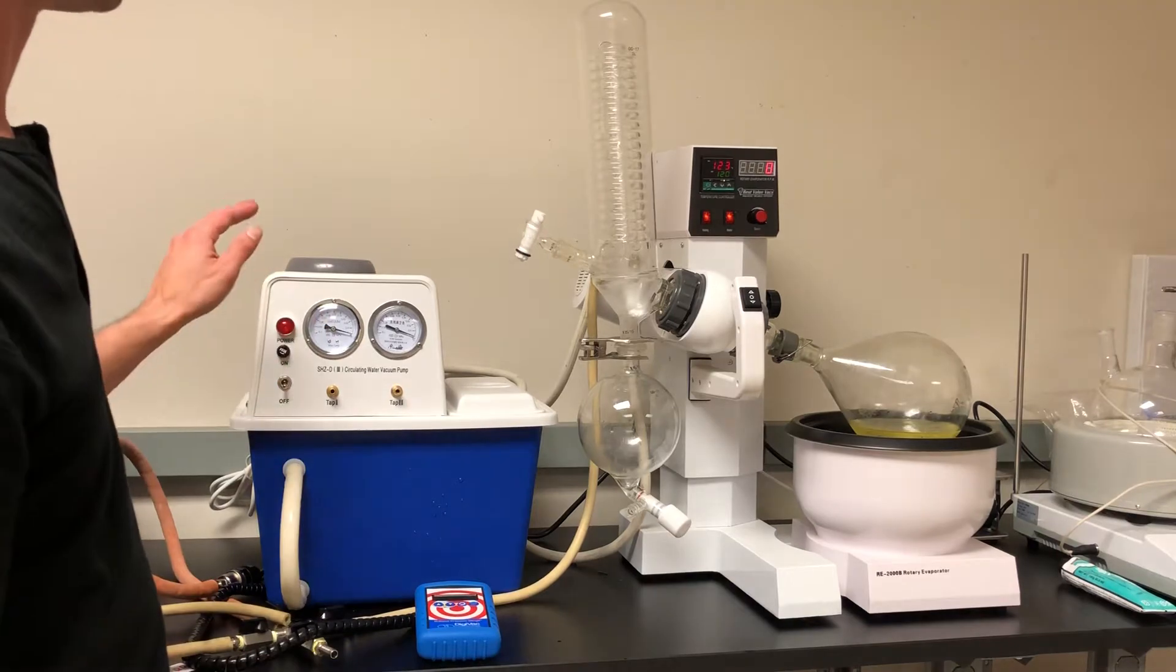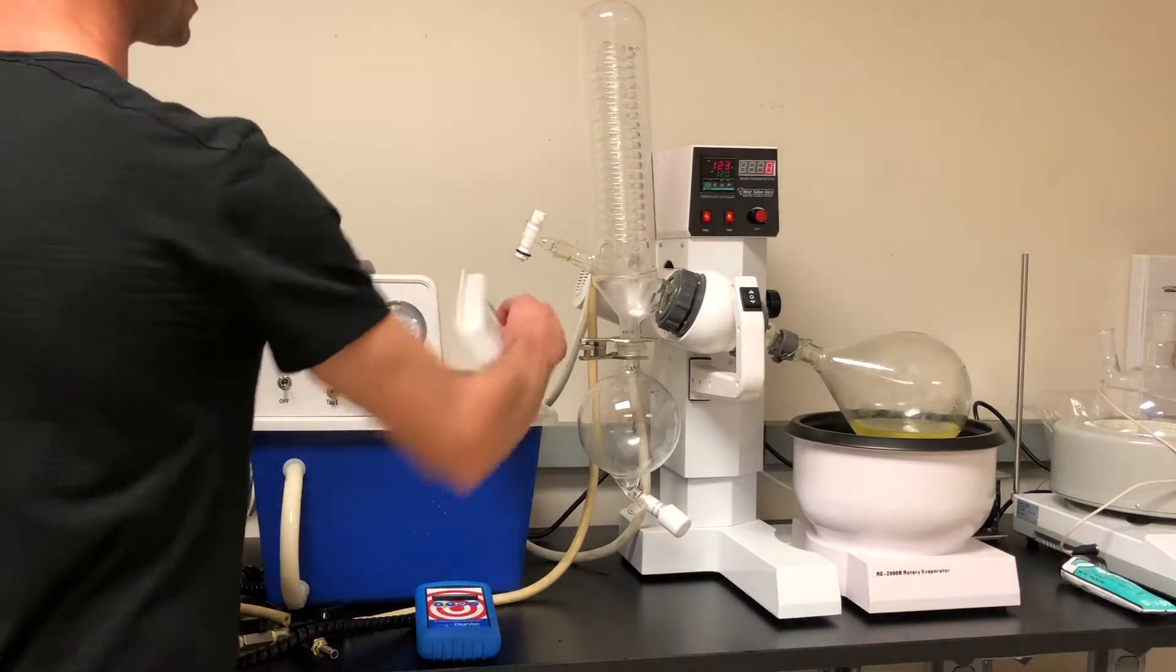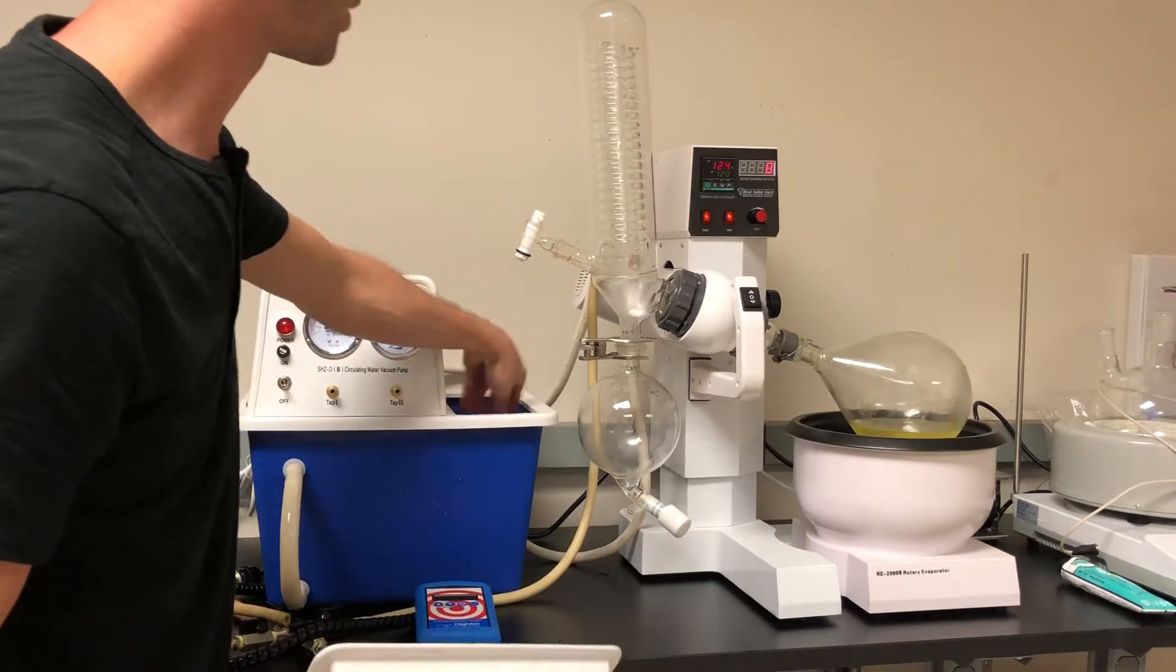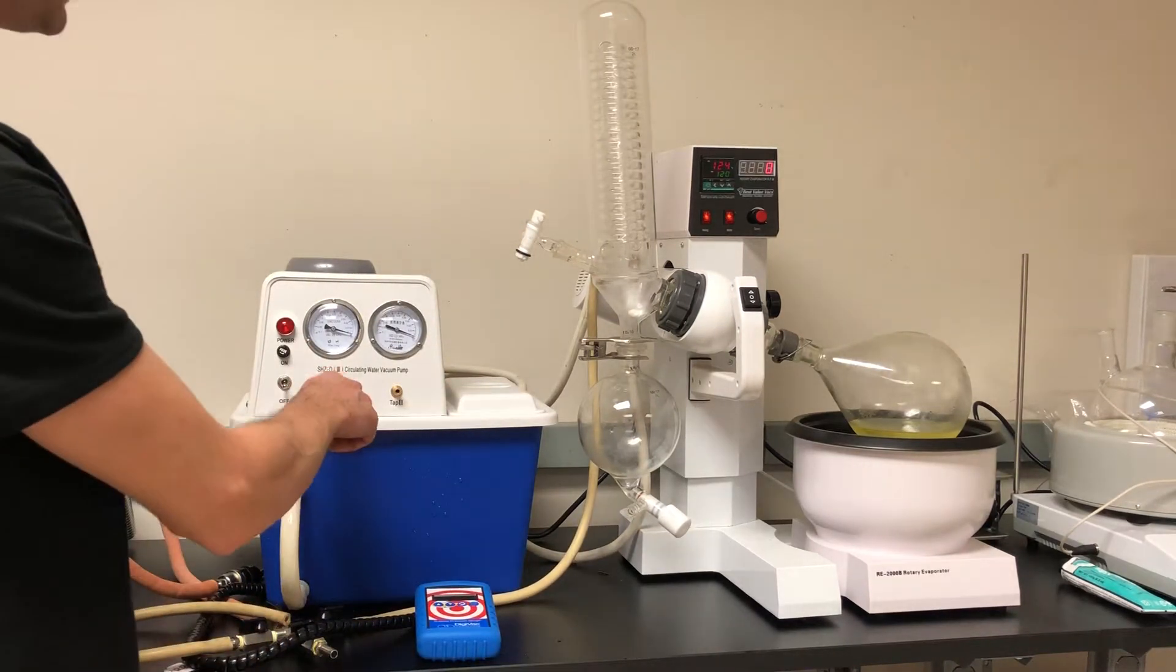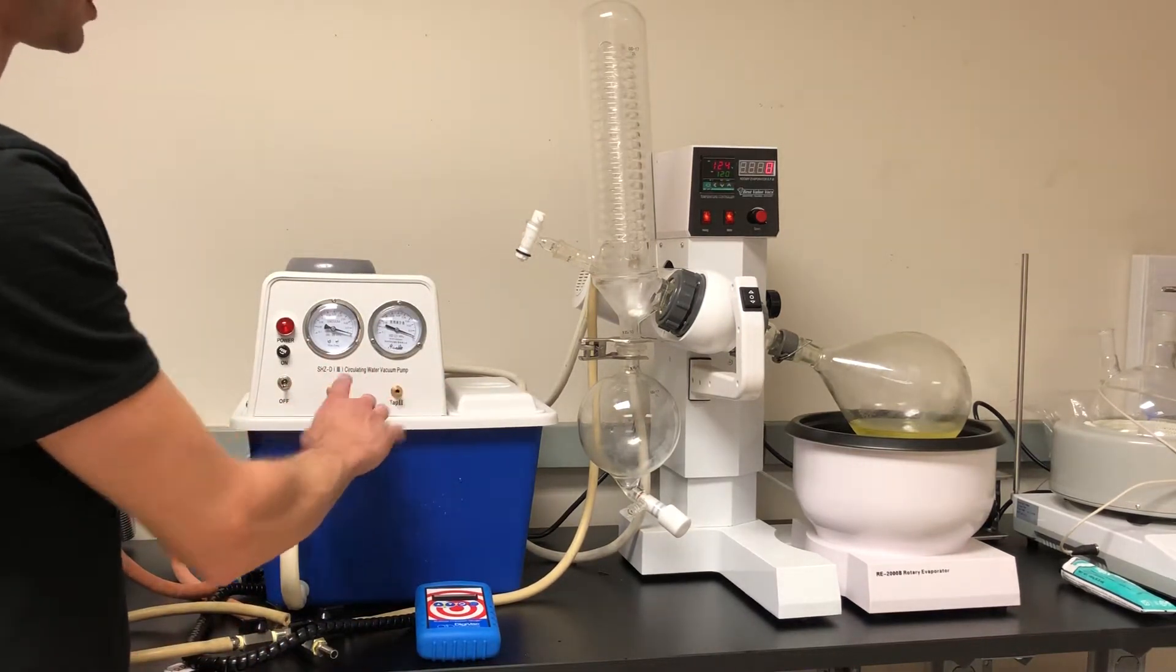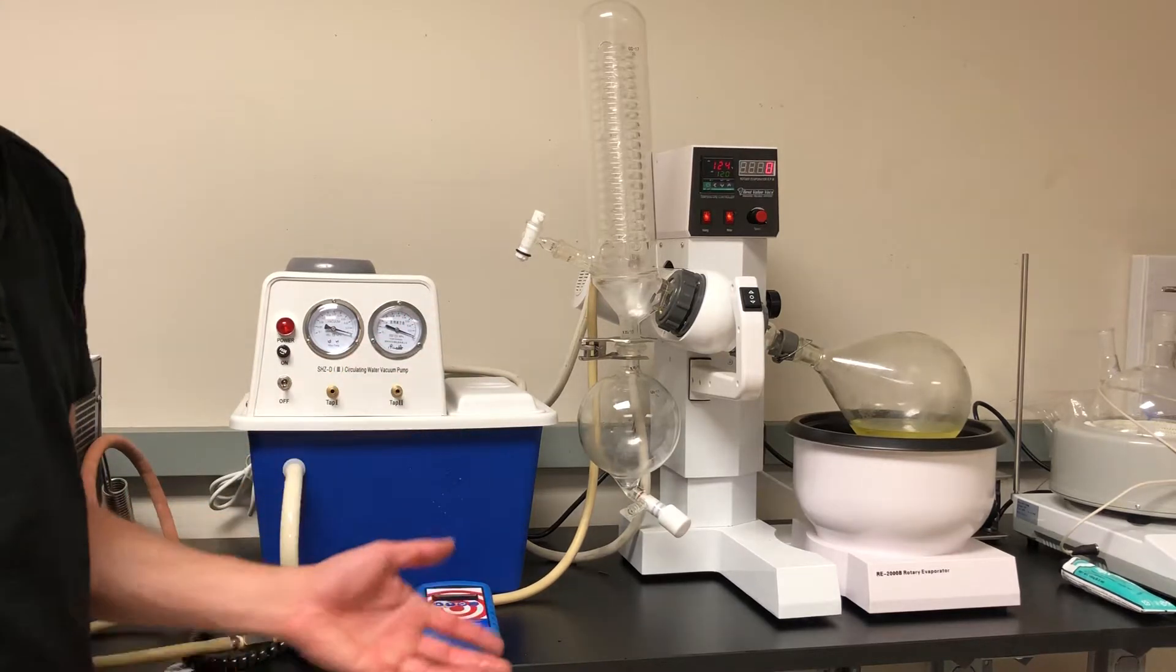I'll start with this is basically an ice bath. So you have your water circulating ice bath built into the bottom. There's a vacuum aspirator built into it. So you have two vacuum ports, two separate vacuum pumps, if you will, built into it.